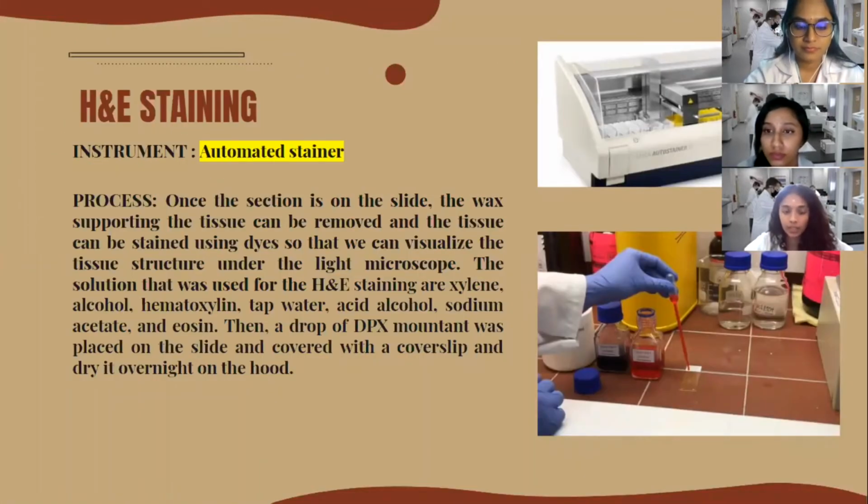Hi, my name is Thivayta and I'm going to discuss the following histopathology workflow, which is H&E staining. A common laboratory method that uses two dyes called hematoxylin and eosin that makes it easier to see different parts of the cell under a microscope. These stains are frequently used in laboratory to highlight the structures in biological tissue for viewing with the aid of different microscopes. It is also used to define and examine bulk tissues by highlighting the muscle fibers or connective tissues, and also cell populations by classifying different blood cells or organelles within the individual cells.